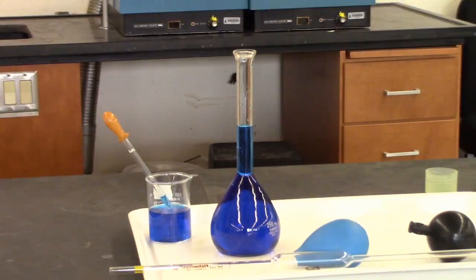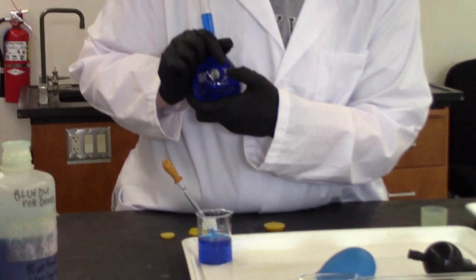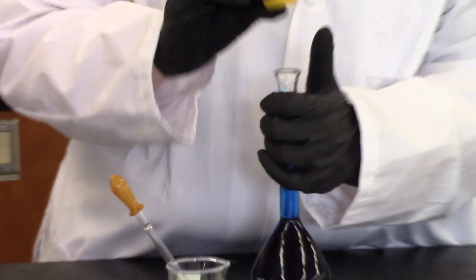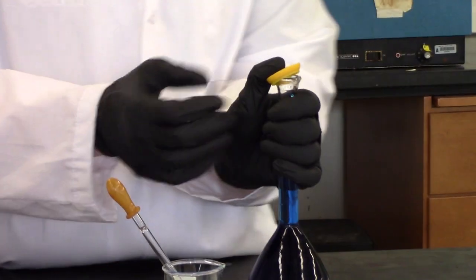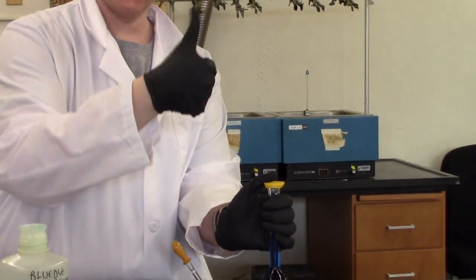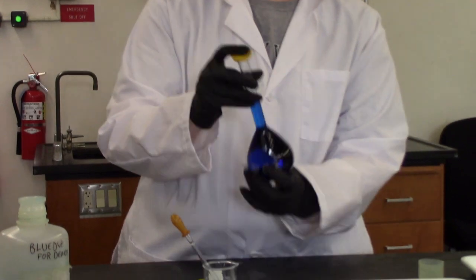Then, oh, I forgot my cap, hang on. So on each one of these flasks, well, not every one, but most of them tell you what size cap. This one says cap number 5, so I'm going to choose cap number 5. These are how they work. They're kind of funky. You don't just push flat down like that. You got to start on one edge, and then you kind of use your thumbs to lean over like this. I'm just kind of pushing with my thumbs from one side to the other, and then it'll snap on.